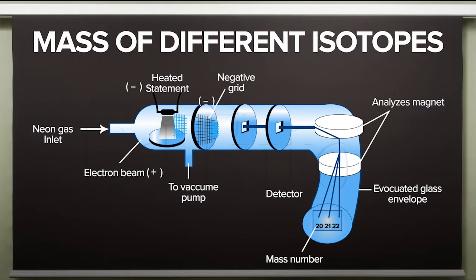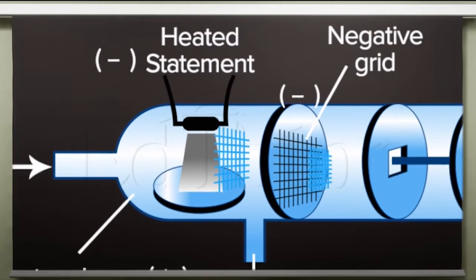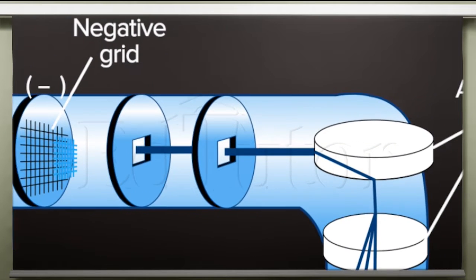This brings up the next question. Do you want to know how this instrument functions? Basically, what happens is a substance that can be a solid, liquid or gas is first vaporized and then ionized by the bombardment of high energy electrons. What do you think will be the result of this bombardment?